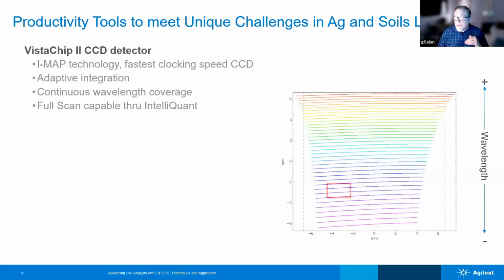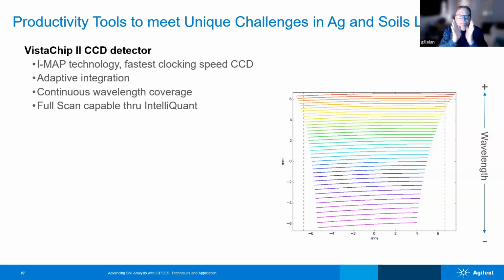Like I said, that small little area is just pixels, and I actually found a kind of a mock-up so that you can see what's going on. The shorter wavelengths are at the bottom there, in that narrower part of the Echelogram. The longer wavelengths are up here. So this is basically how it works.